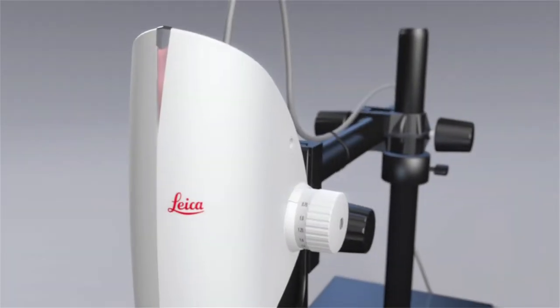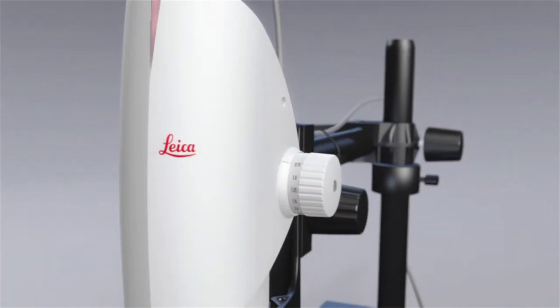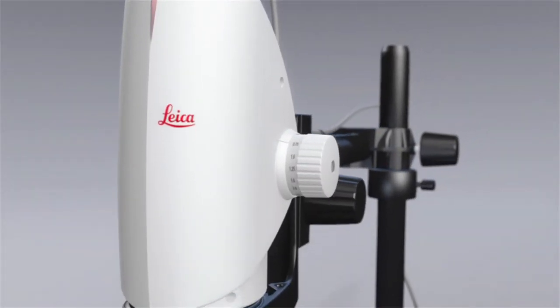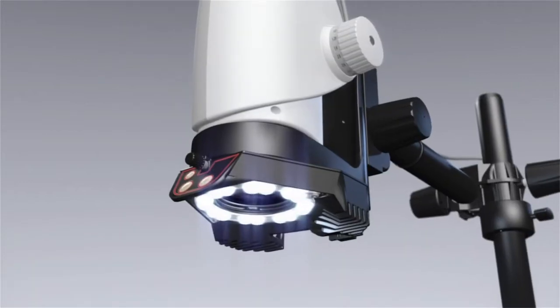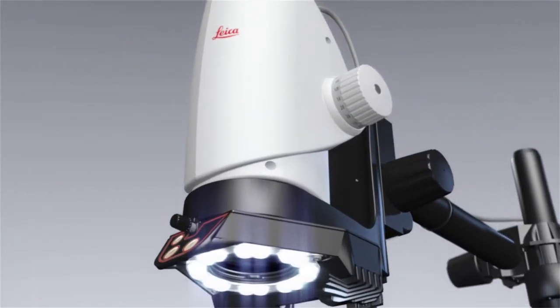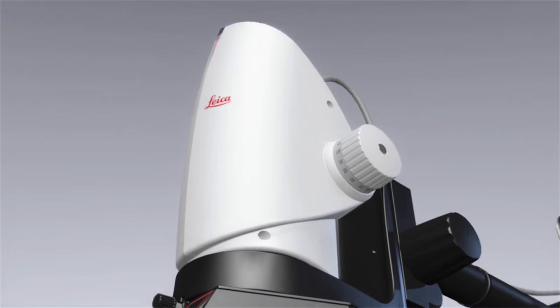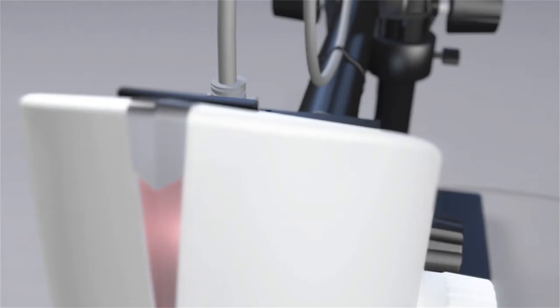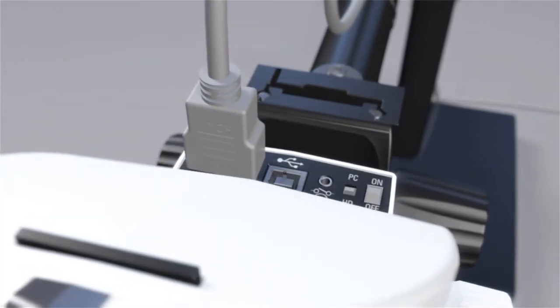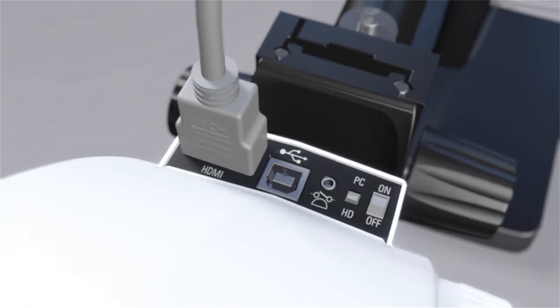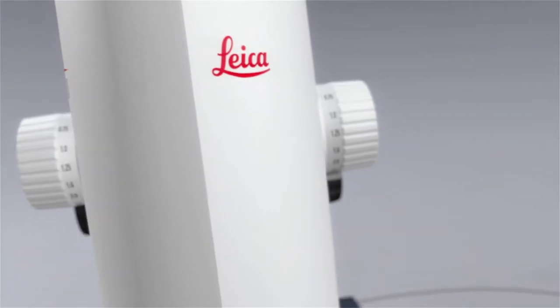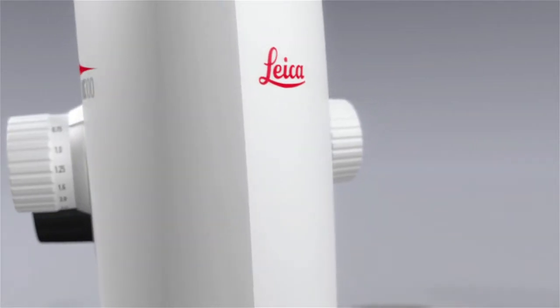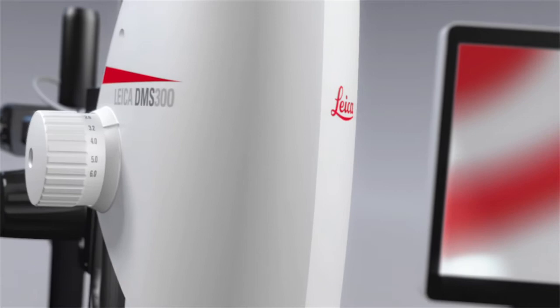Leica Microsystems introduces the newest player to the new age of digital microscopy. A microscope that is a high-resolution digital camera, and a digital camera that is an advanced Leica microscope. Leica Microsystems presents the DMS-300.